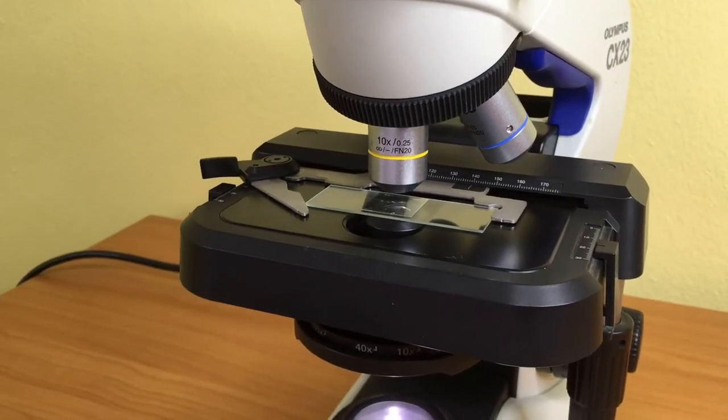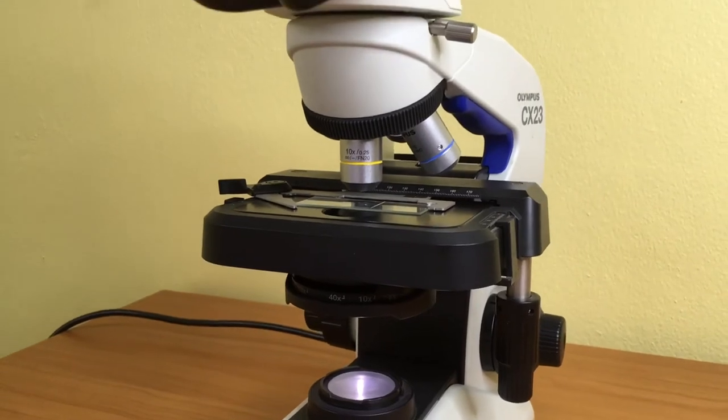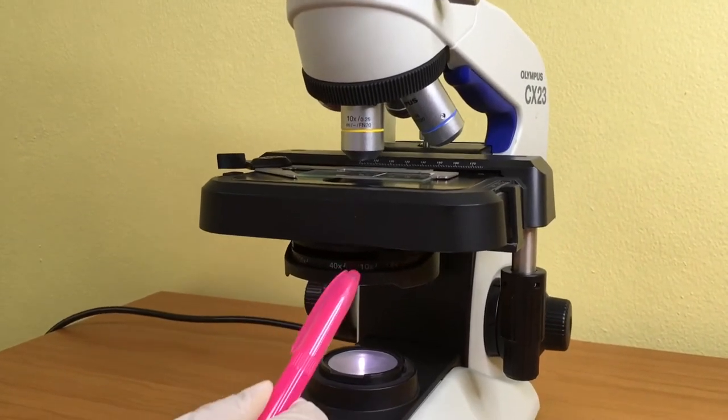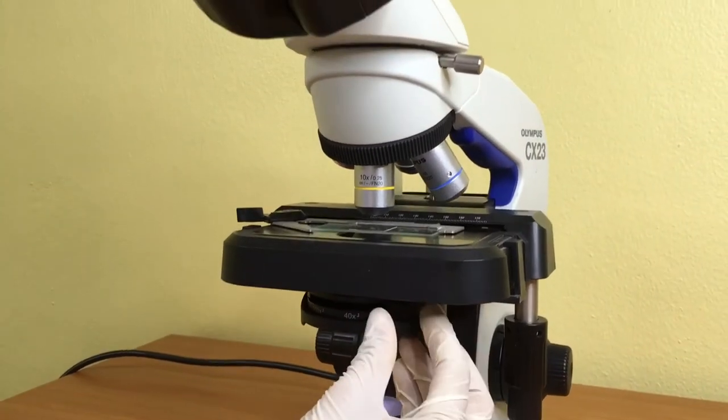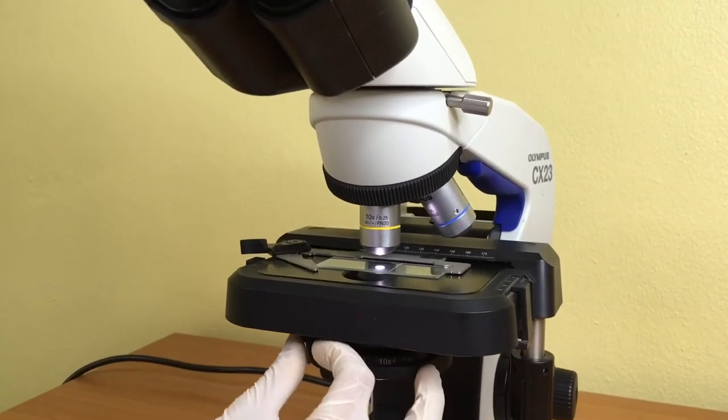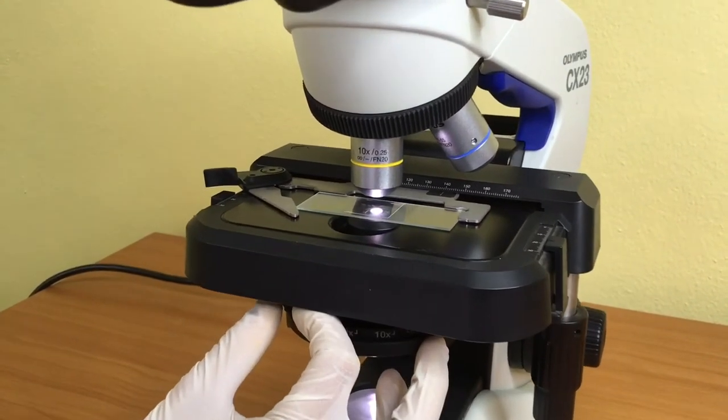Sometimes the image is unclear because it is too bright or too dark. You may adjust the iris diaphragm. The iris diaphragm is a light controller device used for adjusting the amount of light that reaches the specimen.